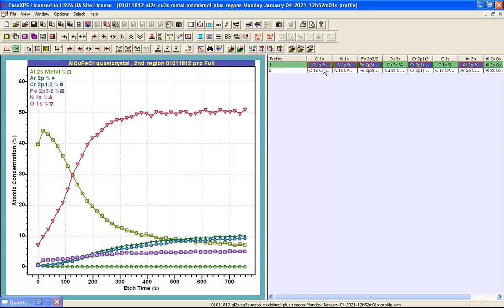And we see now that oxygen which was previously the last is now the first. However the update of the display has not yet occurred.